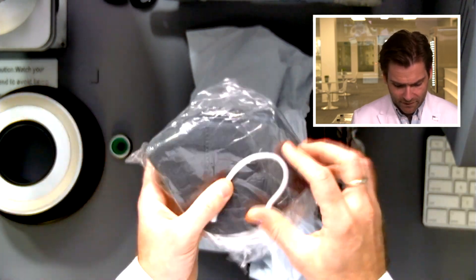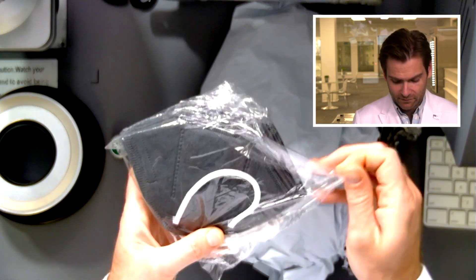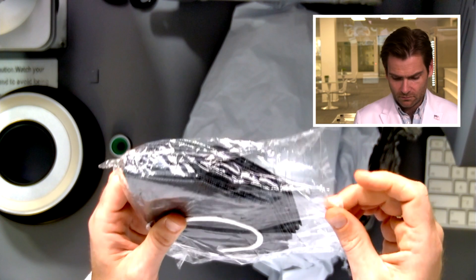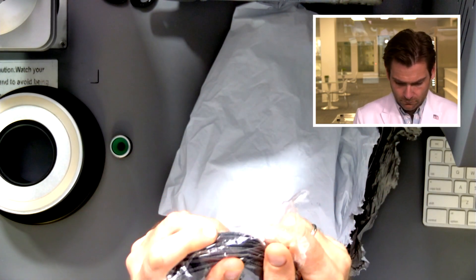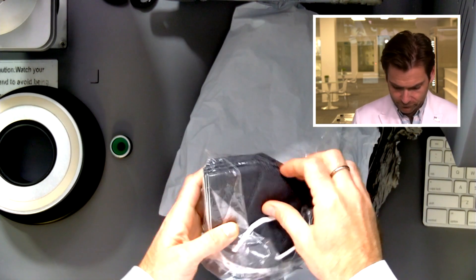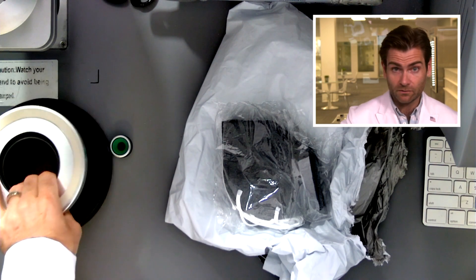It comes in a bag, like what looks like an Amazon pouch, and then it's like an unsealed mask. Wait, is it sealed? No, it's not sealed. Before I really get into this, I need to start the machine going, so I'm going to get this in the clamp.